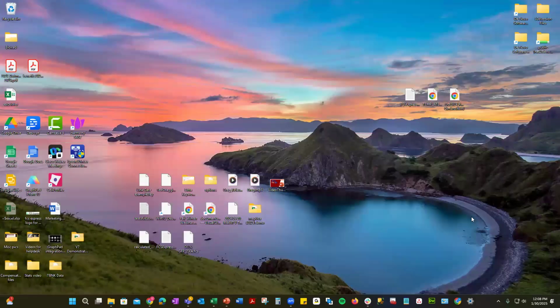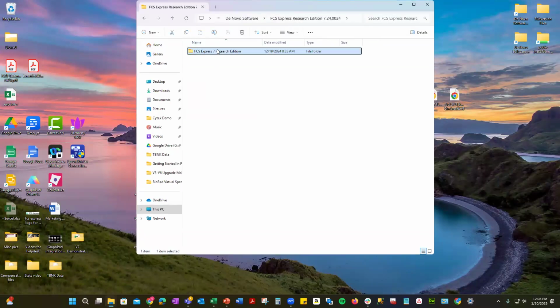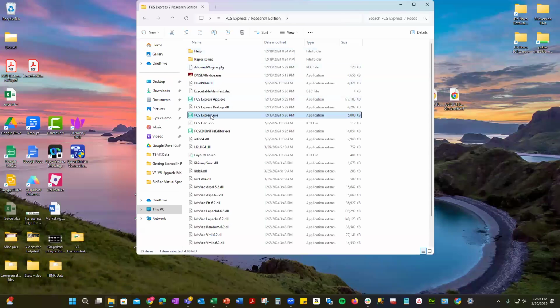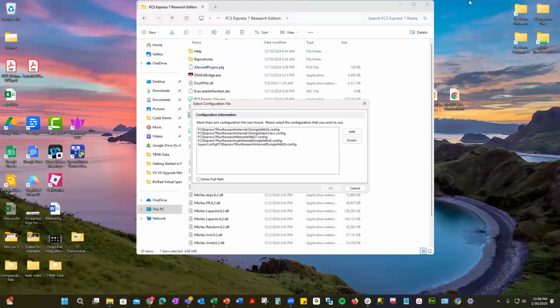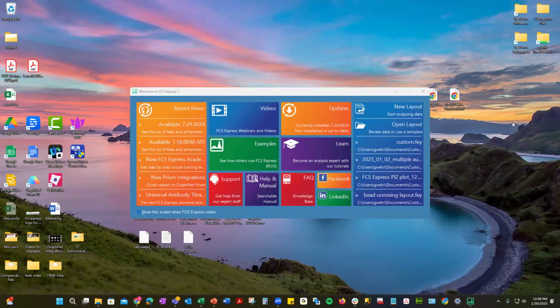And let's get into the software. All right, so let me open up our software here. And we're going to open up FCS Express. It's going to ask you for your configuration file. All right, and you're going to get the splash screen.